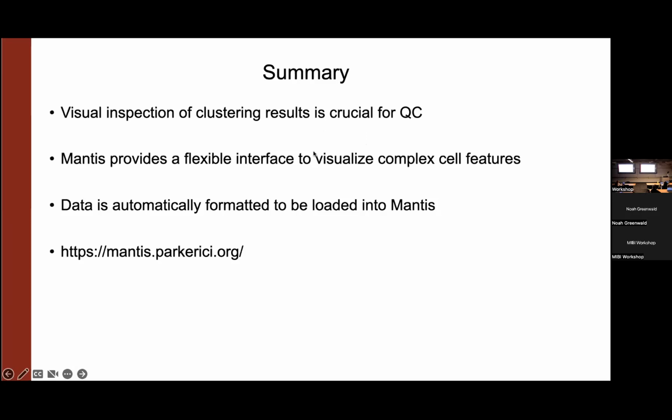Okay, so there's a question about heterogeneity across different images. Can you really set a single threshold across everything? I think this is why we had an entire day on sample prep and making sure that that works. It is so much easier to fix your pre-analytical problems pre-analytically. So if you have differences in staining, you don't want to be fixing that computationally. You want to just not have differences in your staining.